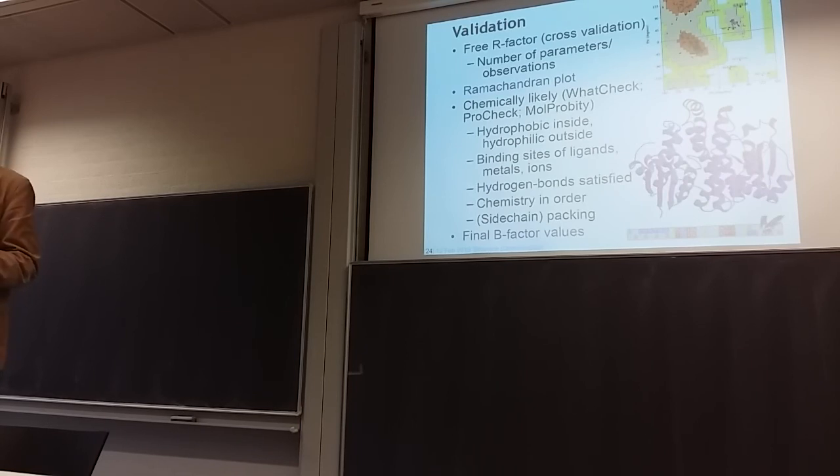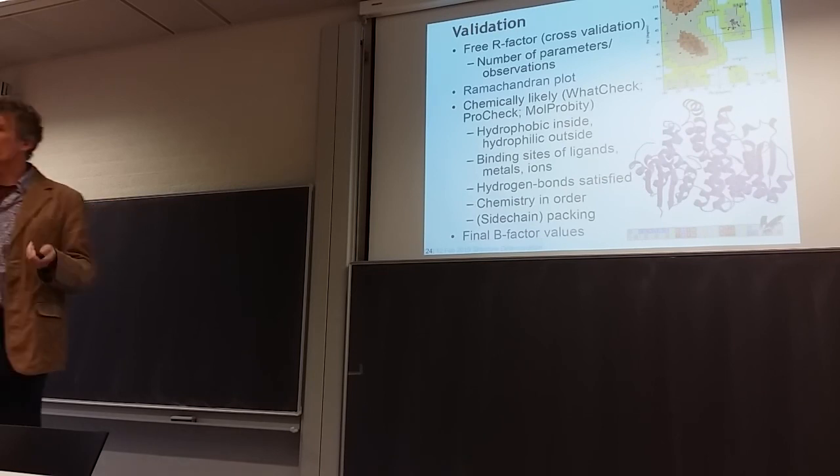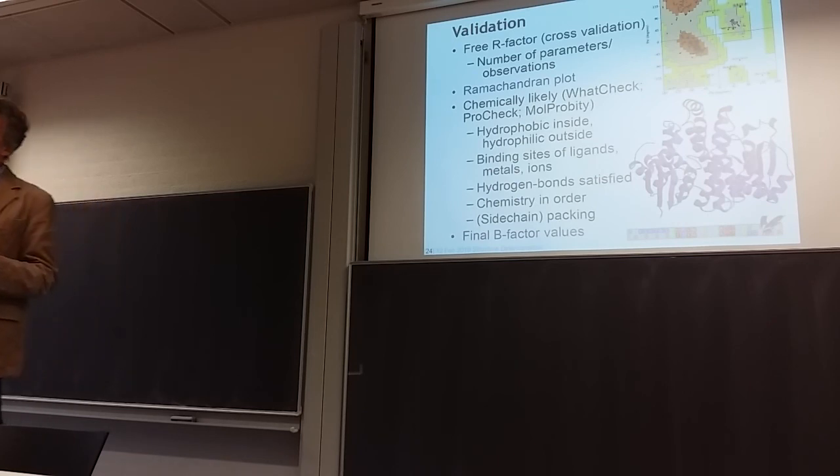And usually there could be two things: it could just be missing data, but usually it's either that this atom can be in different conformations, or it's really just floppy, so it's just moving around all the time. And then it just doesn't actually show up in the diffraction data. So whether you change the position of the atom in your structure, it doesn't really make the fit with your data any better or any worse. Yeah, so that's B factors. Okay, so it's both a measure of the quality of the structure, and it says something about the dynamics of the protein, the local flexibility of the protein.